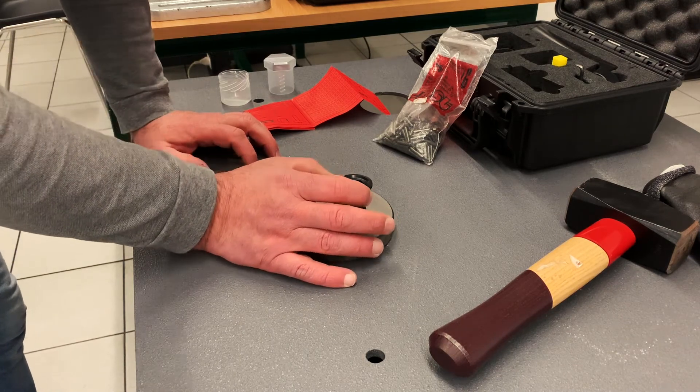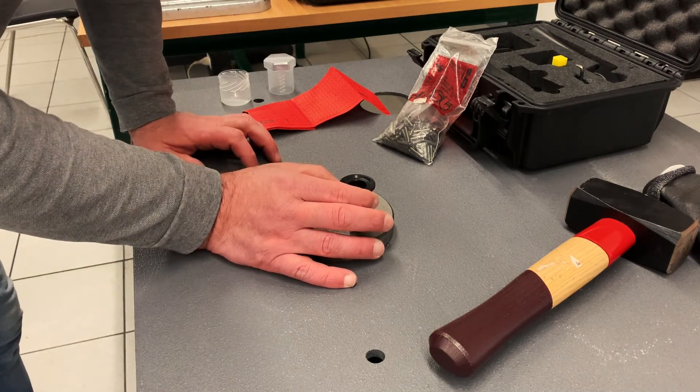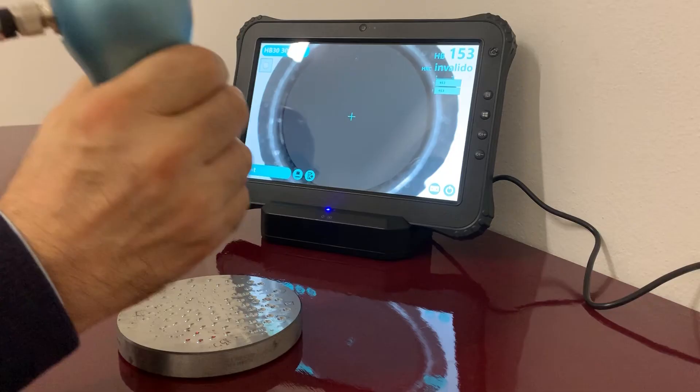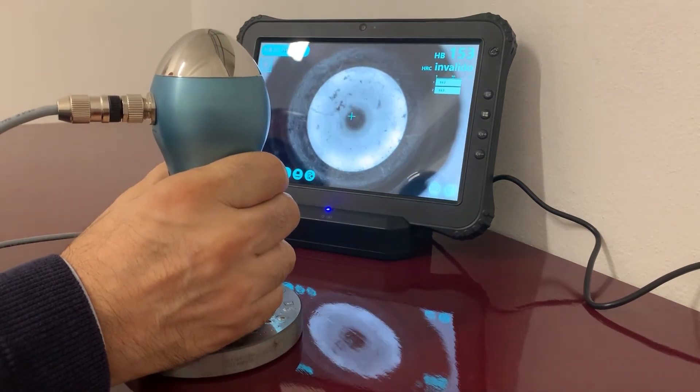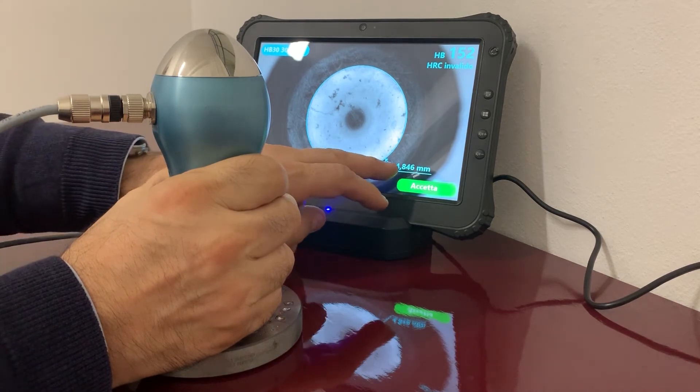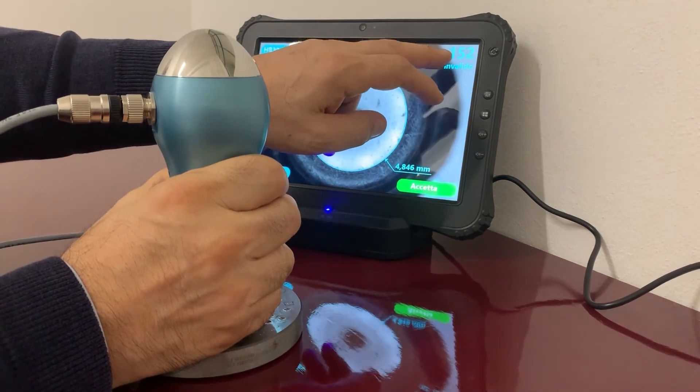The diameter of the resulting impression can be read on a Brinell reader, such as our Antares, or for more challenging measures on the Brinell Iprio Square Optical Scanning System — the only Brinell reader that can be equipped with specific software for indentation reading.